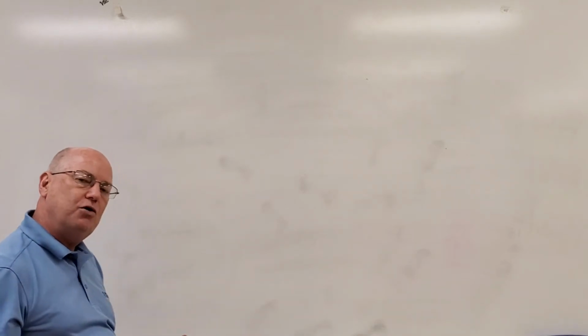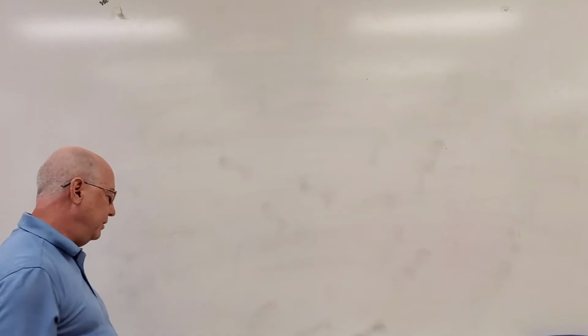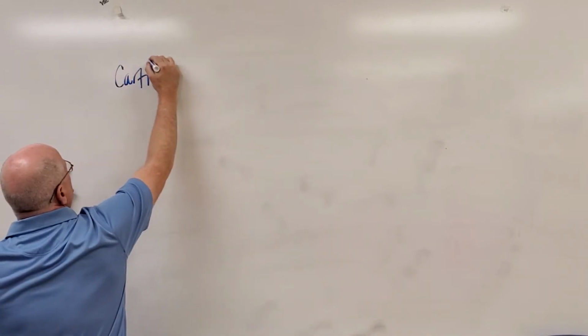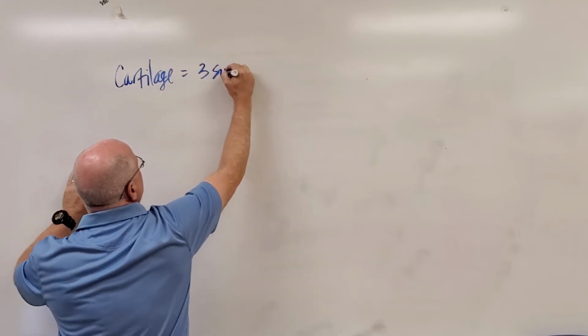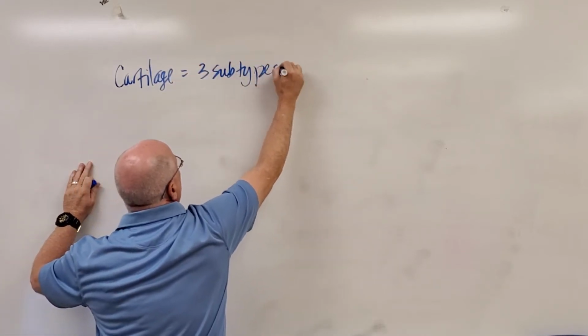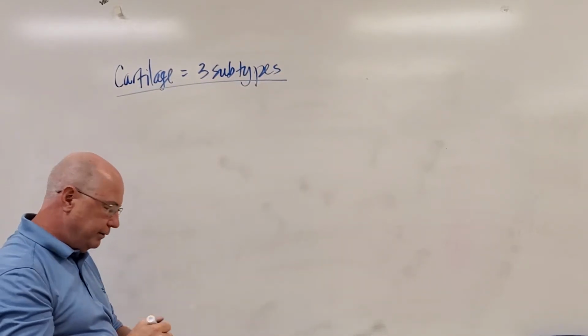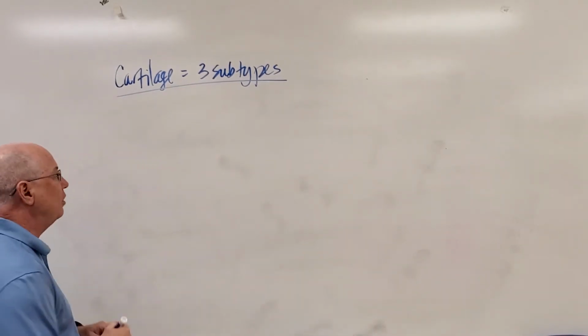And then there's one more slide that we have to go over for our lab test, which is the skin model and the skin slide, and I'll talk about those in another video. Now, when it comes to cartilage tissue, we just learned there are 3 subtypes. And we'll learn the functions and locations for lecture test 2. We're not doing them for lecture test 1. But on our first lab test, you should at least identify the cartilages.